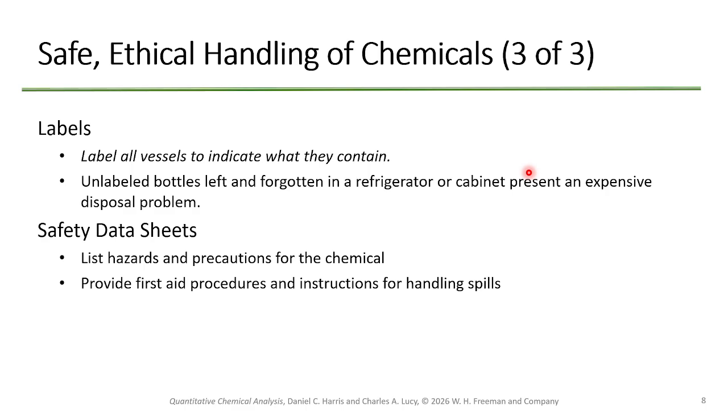Okay? Okay, now, what sort of bottles do you use? Can I use glass? Nice, a volumetric flask. Yeah, you can use a volumetric flask. I wouldn't recommend leaving it that way because you don't have that many, but actually in most labs they have plenty and they just do. Yeah. Is glass always the answer though? I made up sodium hydroxide. Should I leave it in glass?